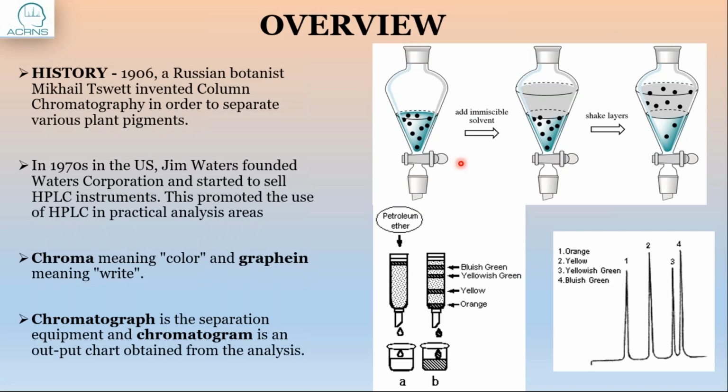Separating funnels were used to separate compounds based on their solubility in different immiscible solvents. This type of separation technique was used over many centuries and was done in a very crude fashion.